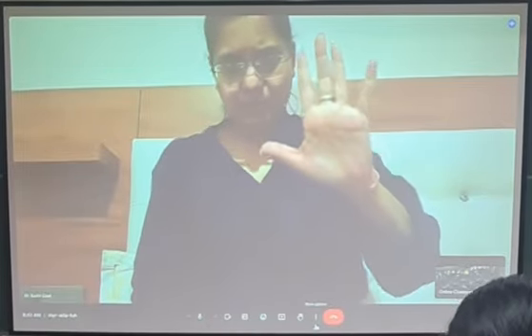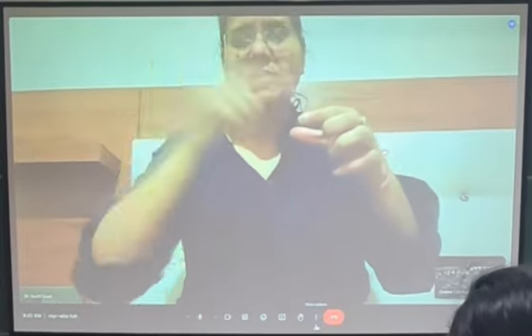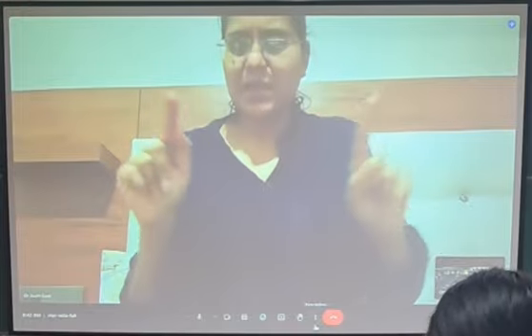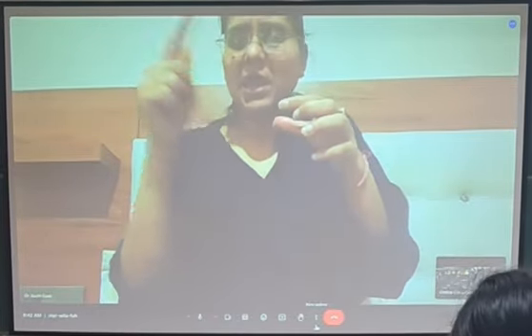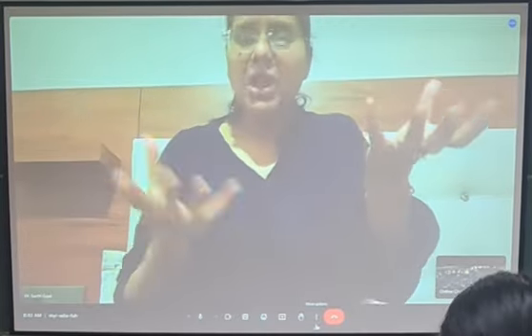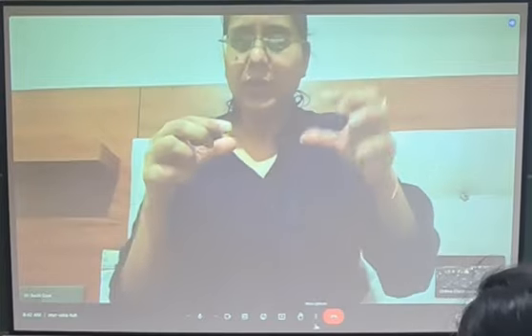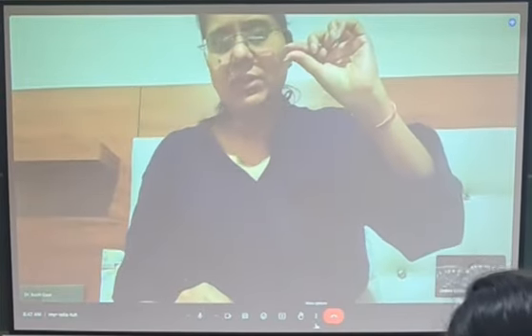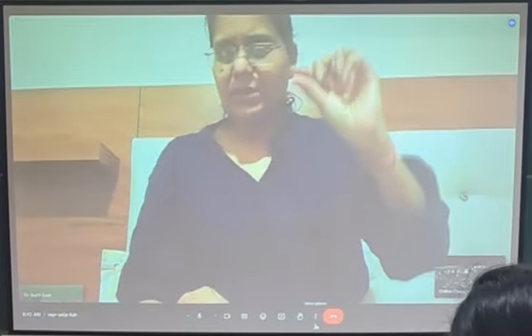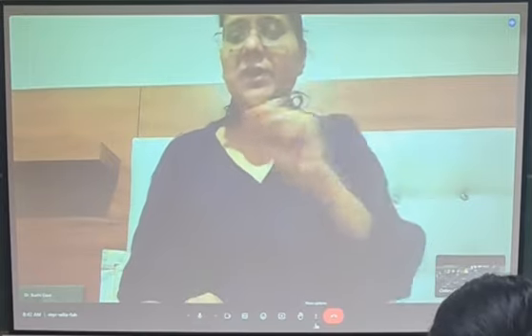A hemocytometer is a very simple instrument. Imagine a slide with different squares marked on it. You have a slide where the squares are engraved on it, and you can differentiate them, because when you see under the microscope, you cannot otherwise tell which square is what. It gives you a 0.1 millimeter thickness. So when you put a cover slip, you get a thickness of 0.1 millimeter, and then what you have is your squares with different numbers of lines.